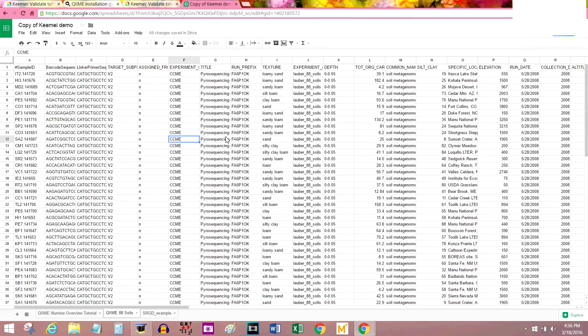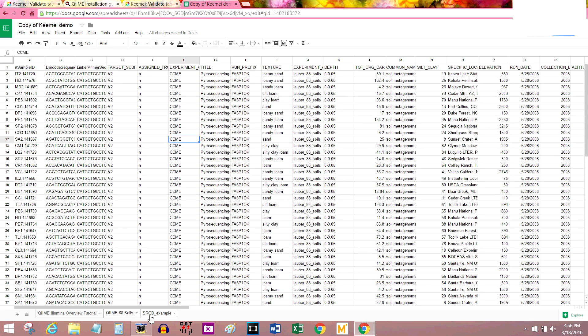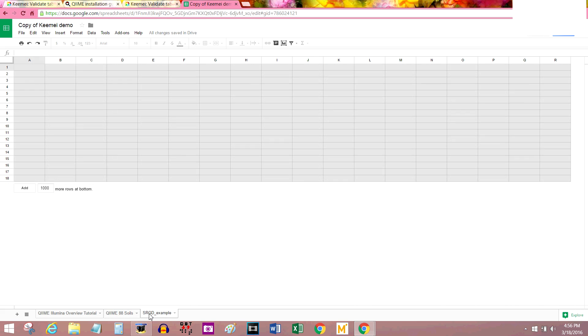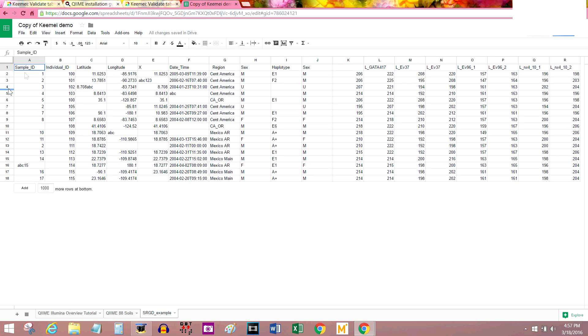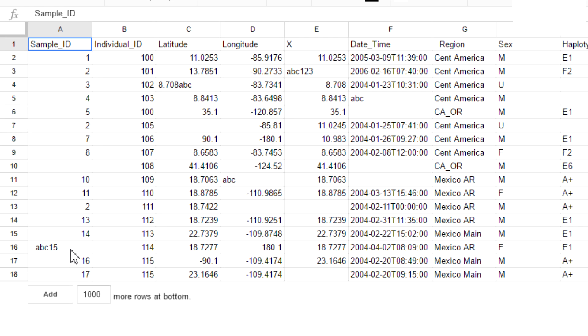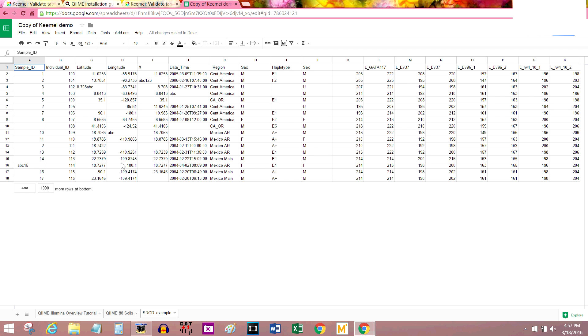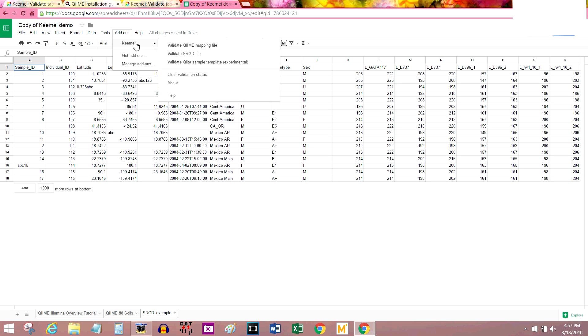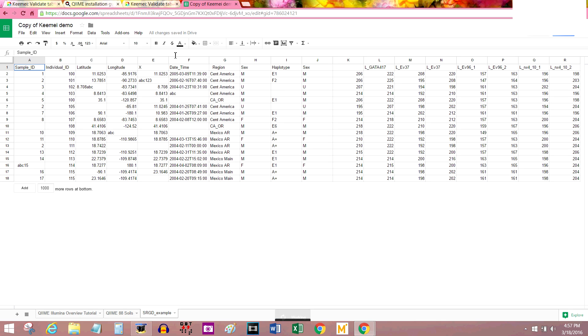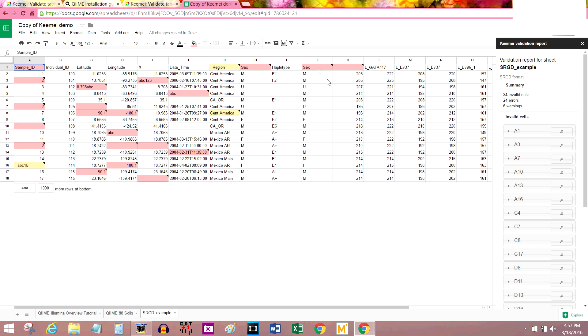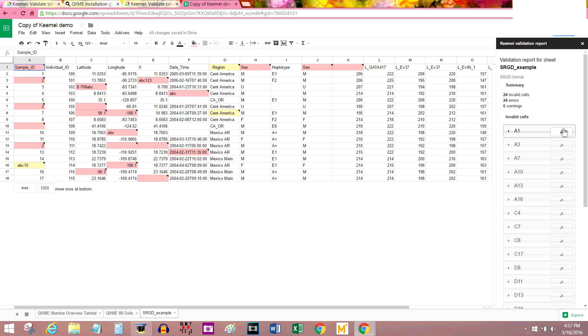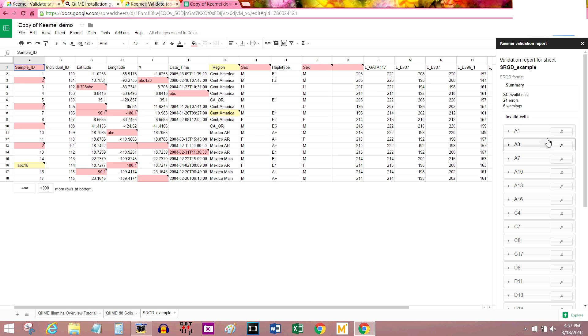One last thing I'm going to show you in this tutorial. You can also use Keemei to validate SRGD files. This is the example given and you can see all of the errors. I mean, they really made it obvious this time. They literally put ABC 15 into random cells. But you do it the exact same way. Go to Add-ons, Keemei, Validate SRGD file. And the red and yellow cells pop up with their warnings. As well as this focus functionality here on the right in the validation report. And I'm sure as soon as you got rid of all the errors, it would give you a clean bill of health and you can export that as well.